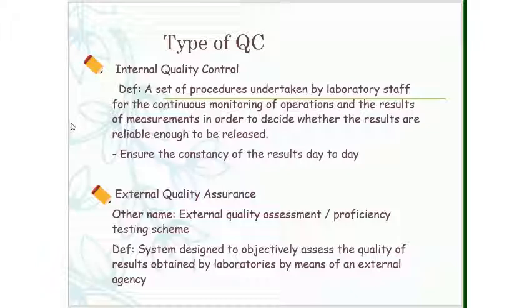Second is external quality assurance. The other name is external quality assessment or proficiency testing scheme. It is a system designed to objectively assess the quality of results obtained by laboratories by means of an external agency.